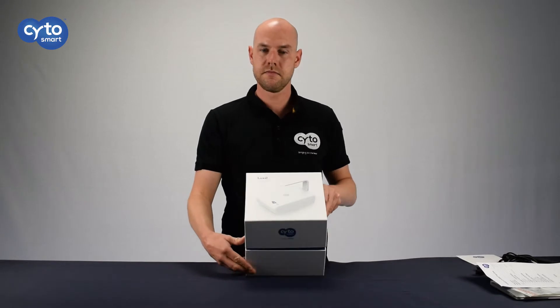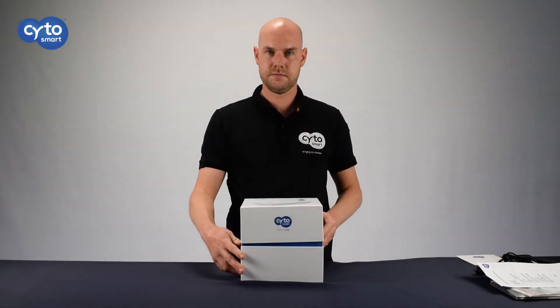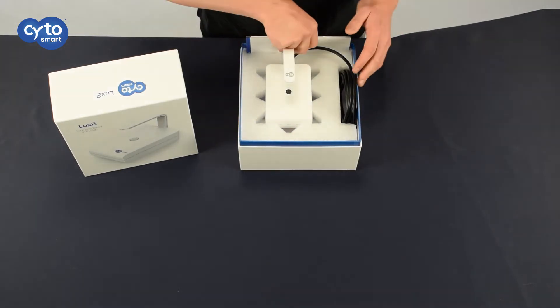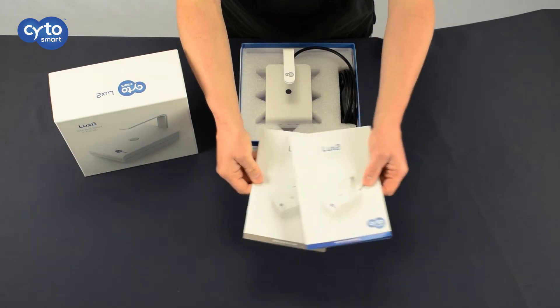Next, we move to the star of the show! The product box contains the device, cables, and paperwork. You'll receive a manual and a quick starter's guide to help you get the best results!